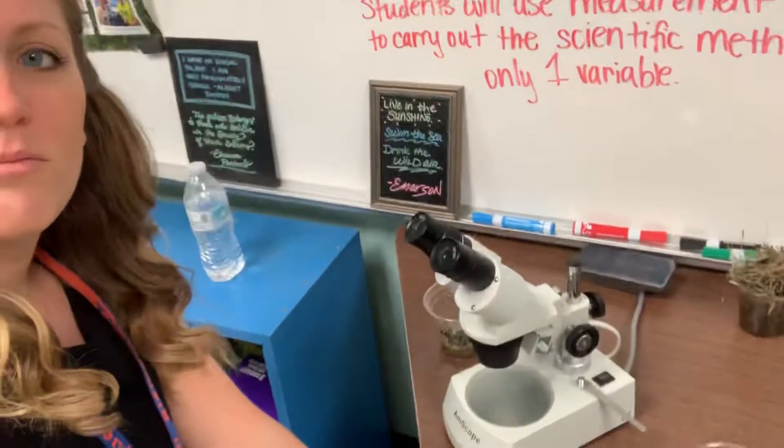Good morning. This is looking at what are different kinds of microscopes. First of all, we're going to take a look at what a dissecting scope looks like.